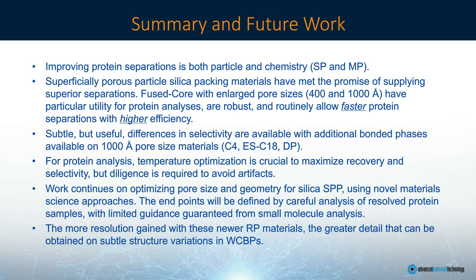The work continues on optimizing the pore size and the geometry for silica SPP, and the endpoints will be defined by careful analysis of the resolved protein samples, with limited guidance guaranteed from small molecule analysis. And the more resolution gained with these newer reverse phase materials, the greater detail that we can obtain on subtle structure variations in these proteins.